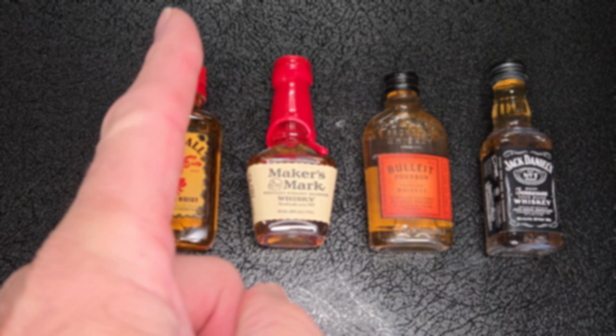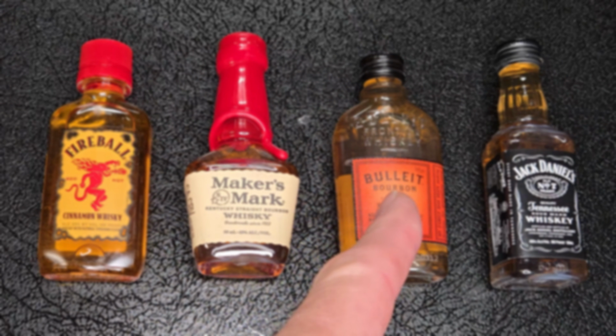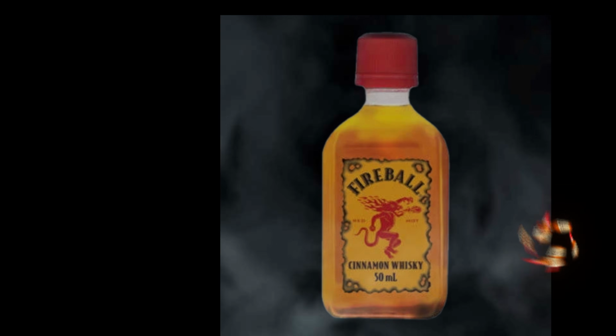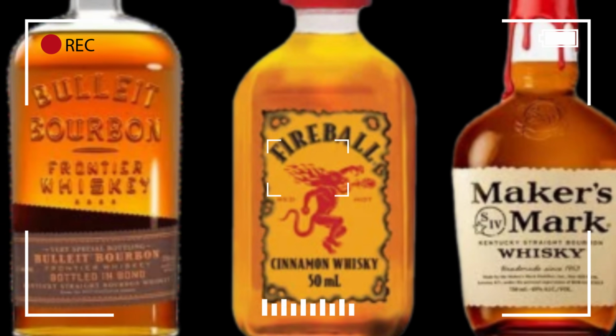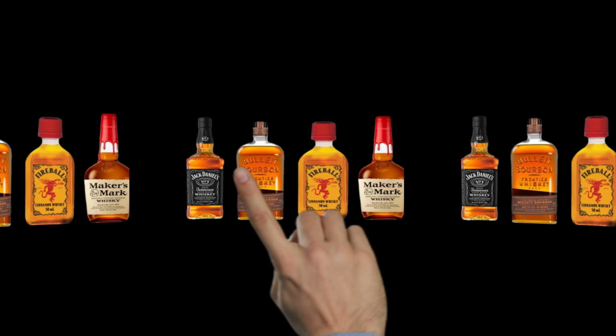So I've got 4 of the most popular whiskeys sitting here right on the workbench. Fireball, Maker's Mark, Bulleit, and Jack Daniels. I'm labeling them sample A, B, C, and D, because I don't want the names influencing what we think we're seeing. By the end of this video, we'll reveal which sample was which.